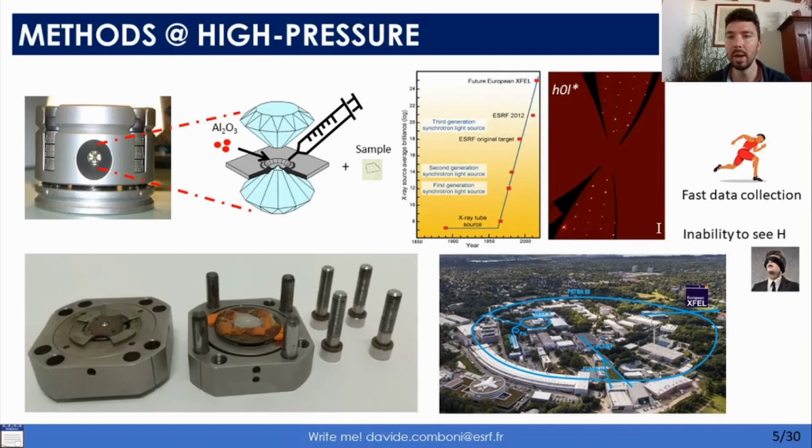When you work at high pressure, it's always important to work with a nice beam with a high intensity and so on. We performed the experiment at the DESY PETRA III synchrotron in Hamburg. The data collection was very fast, the data quality was extremely high, and here you can see an example of the reconstruction of the h0l crystallographic plane. As you can see, the peaks are very sharp, the intensity was okay, and again, the data were extremely good.